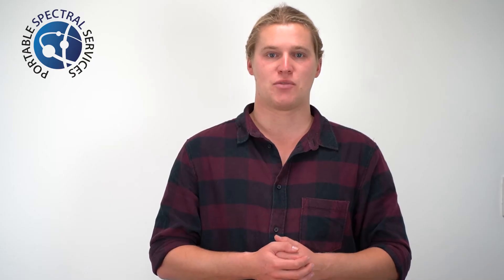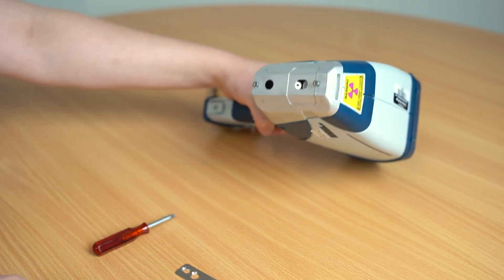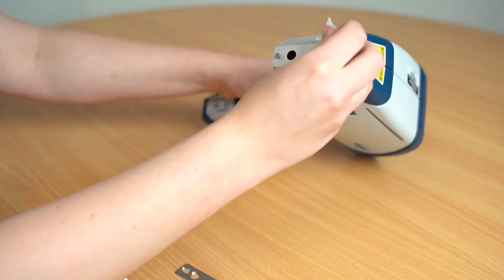For the Bruker I'm using, the window is a sticker, so go ahead and peel it off. Once you've exposed the open window, it is crucial to not allow excess dirt inside, so using your alcohol wipe, wipe around this area — not attempting to clean inside or touching the detector.